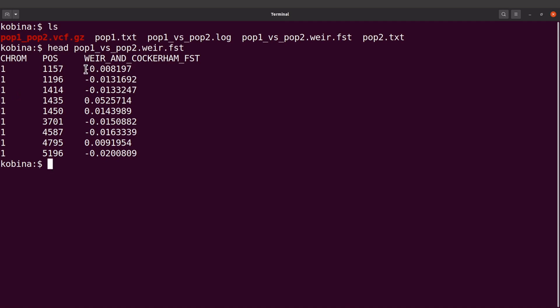Okay, now the FST, sometimes you have negative values but these negative values we always convert them to zero. Okay, because FST values we normally put them in the range of zero to one. So if there is negative, we just make them zero. That's what you should know.